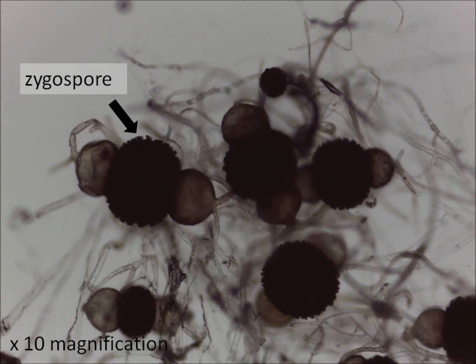This one is a mature zygospore with swollen hyphae at either side. These are called gametangia, and you can see the smaller, finer hyphae going into and out of this structure.